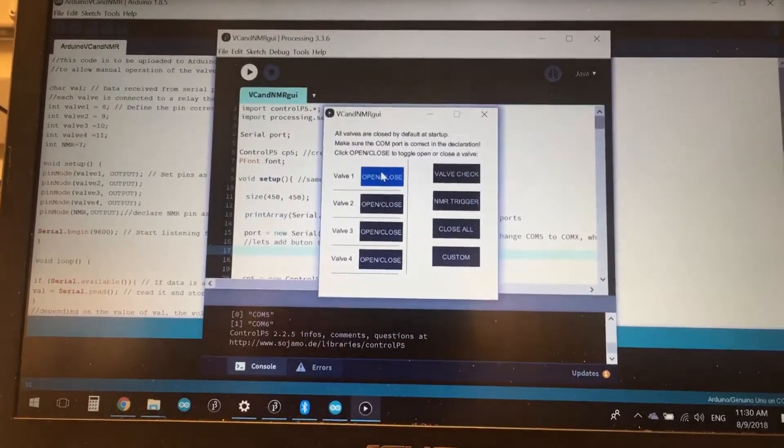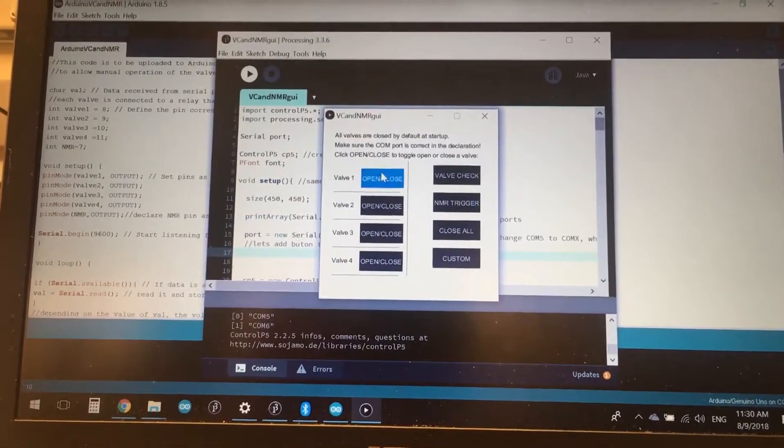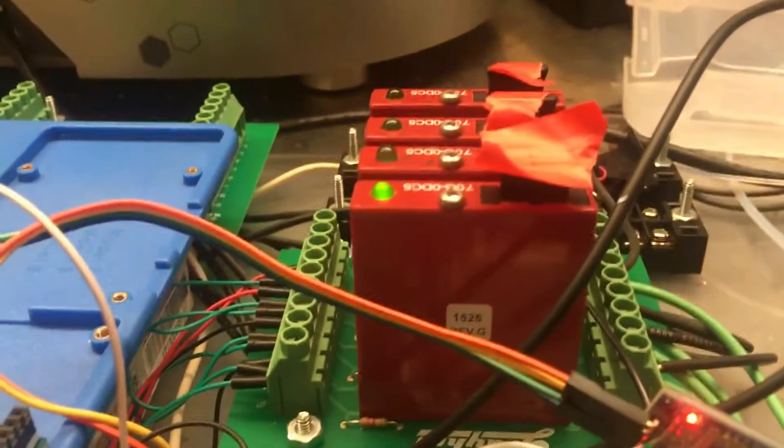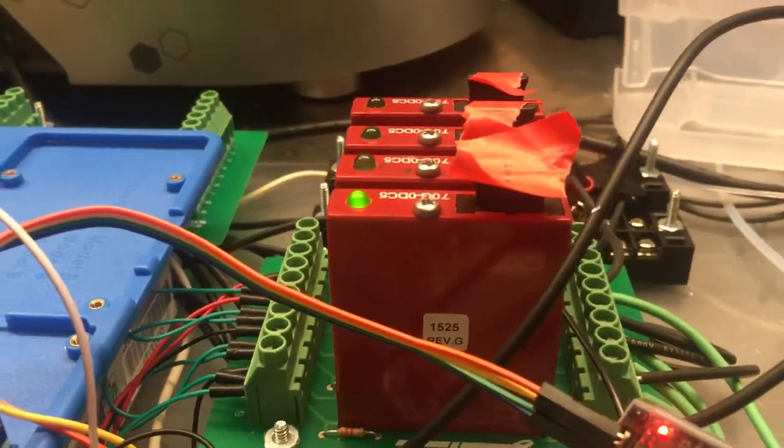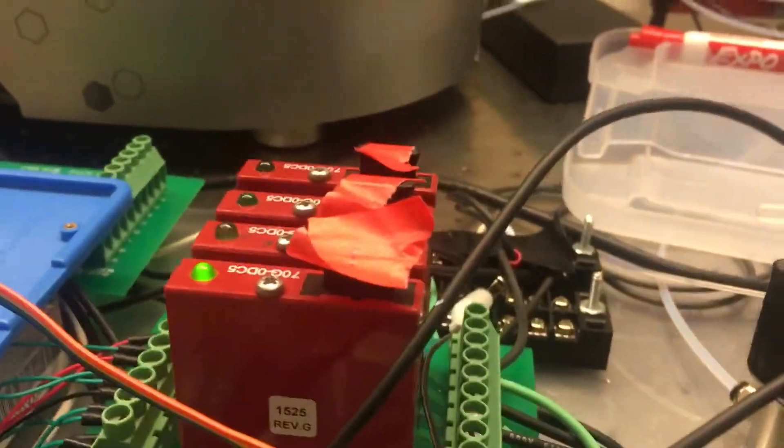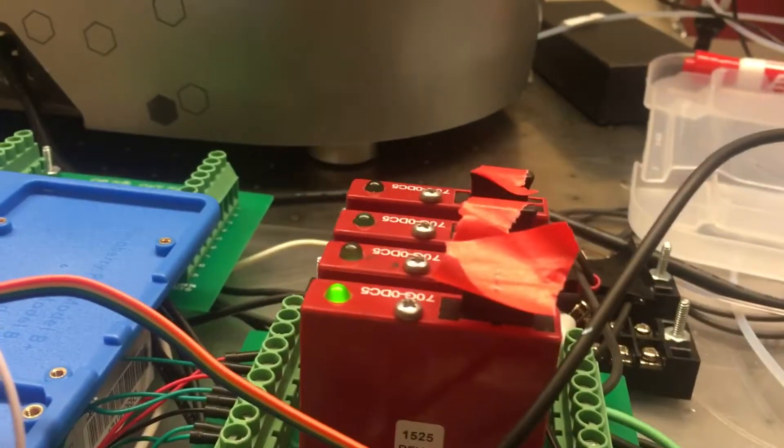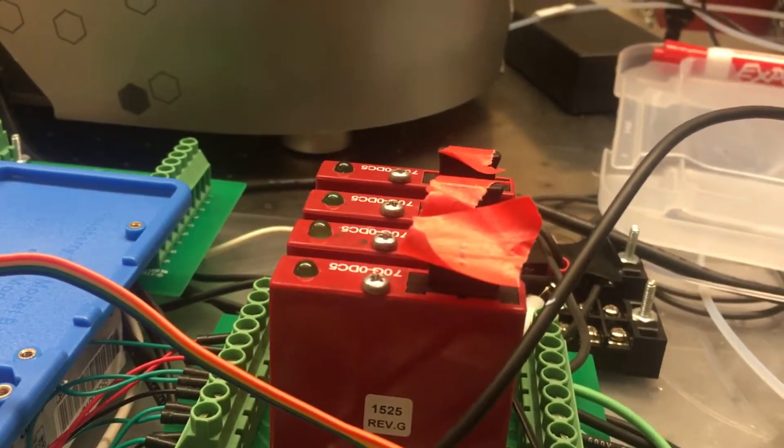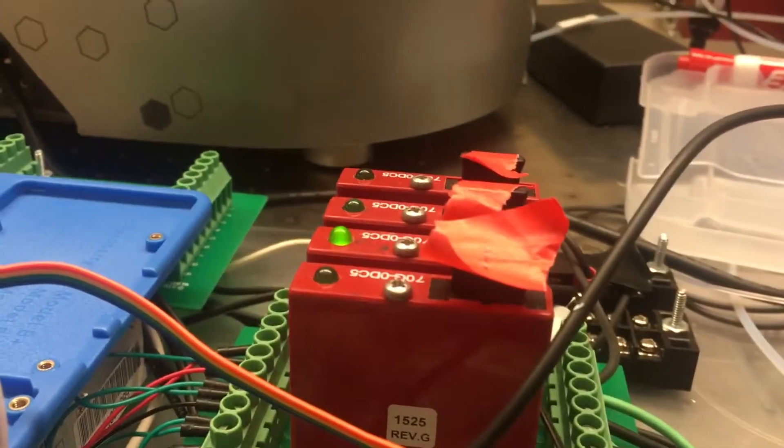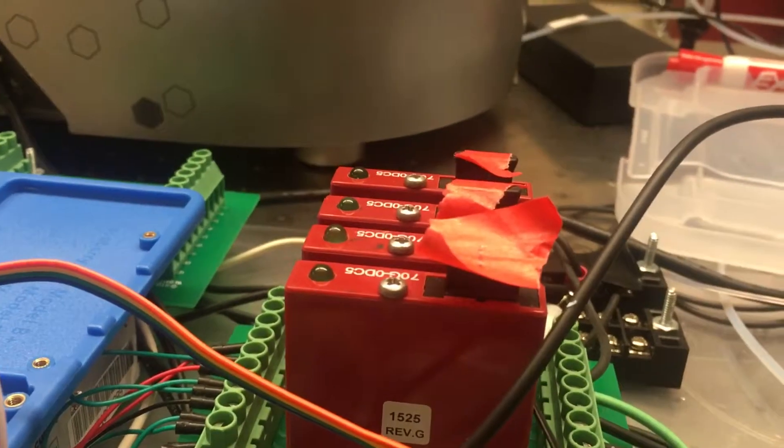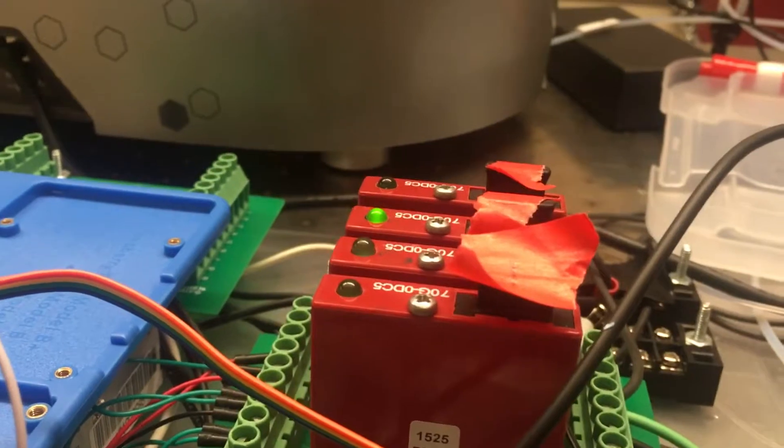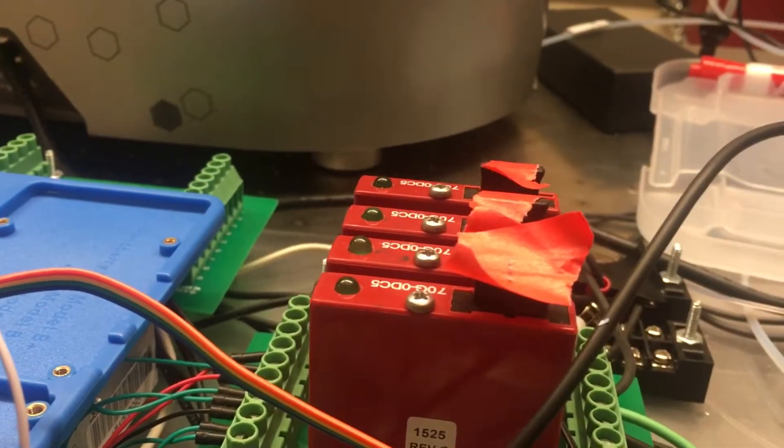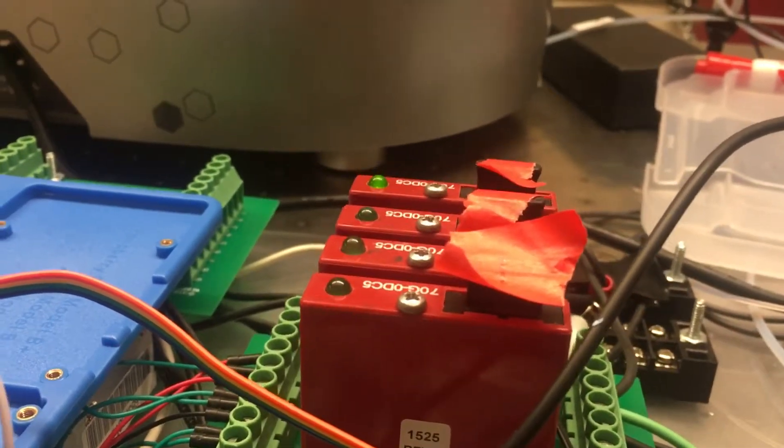So if we go to valve one, for instance, we click open, we can now see that the light here is open, and if I click close, it closes it wirelessly. We can do the same for valve two, three, and four.